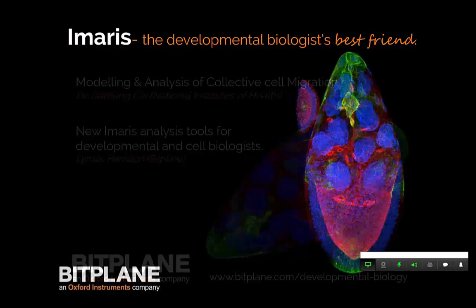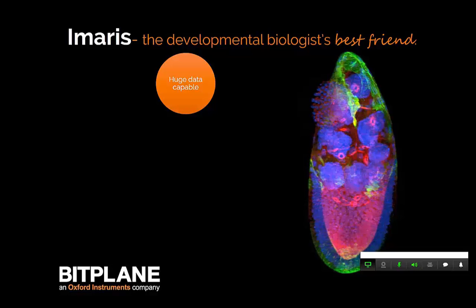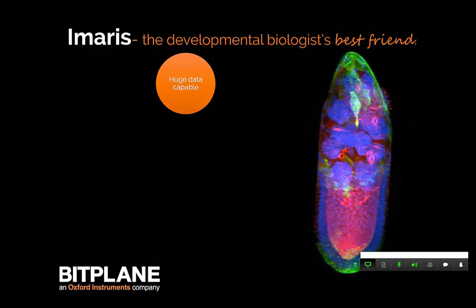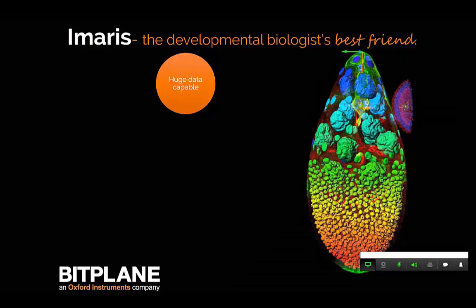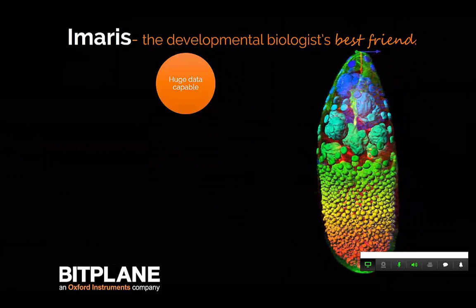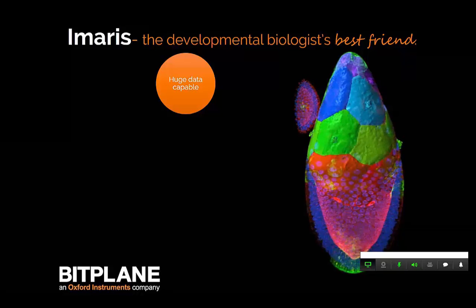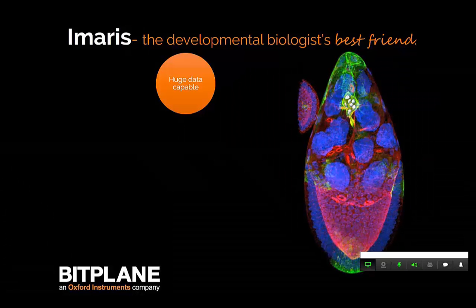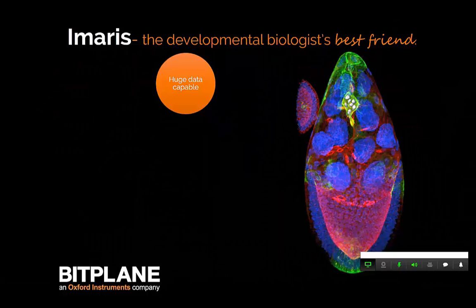So to get started, I wanted to mention that we have a market-leading application that's specifically designed for the analysis and visualization of big data. You'll see that we have a data set on the right-hand side of an egg chamber that has been reconstructed in Imaris, along with some of the modeling that we utilize for measurement and visualization purposes. One of the issues that people are coming across these days is that in order to image these live cells or compartments, it takes a huge amount of time and storage to collect the data in order to generate the analysis. So I'm going to be discussing a few items in regards to handling big data.